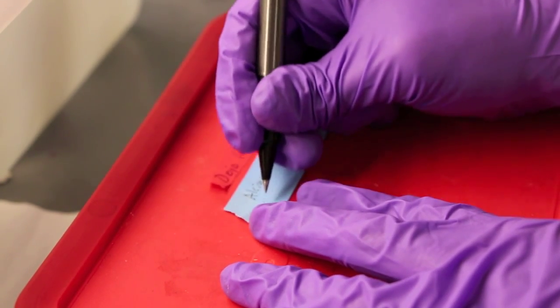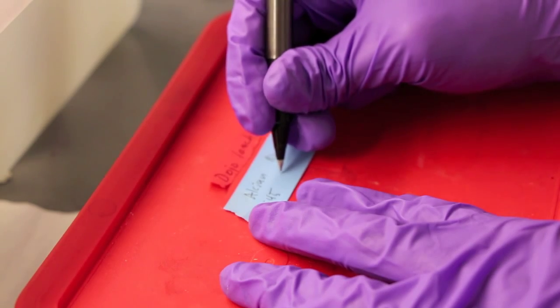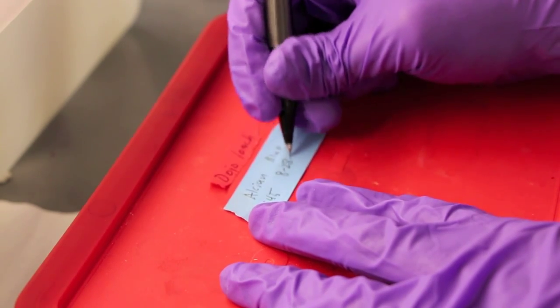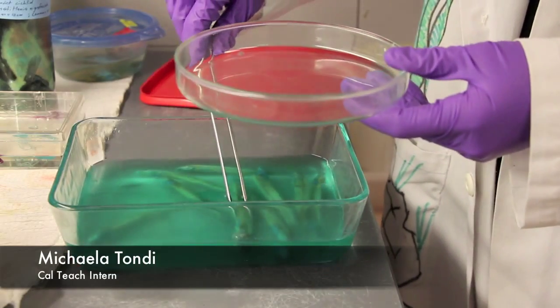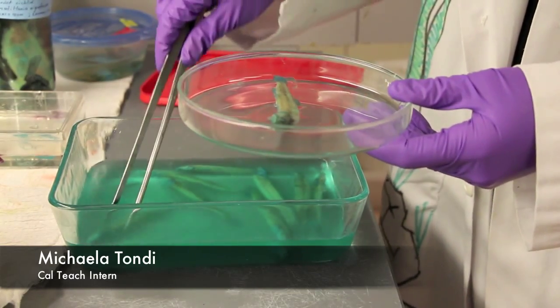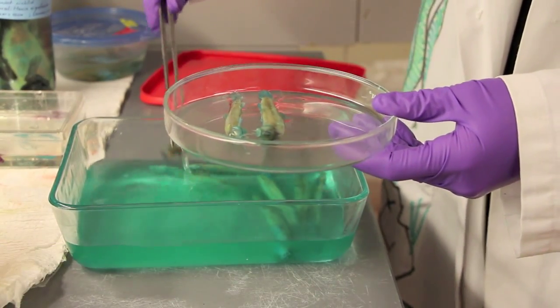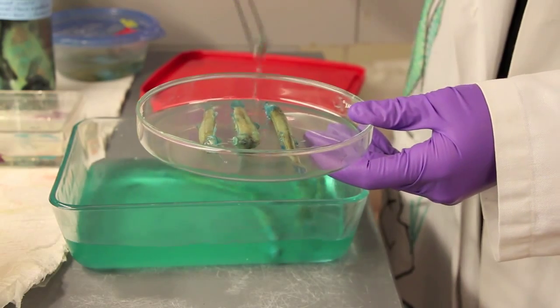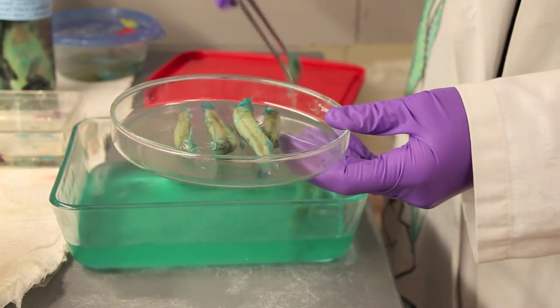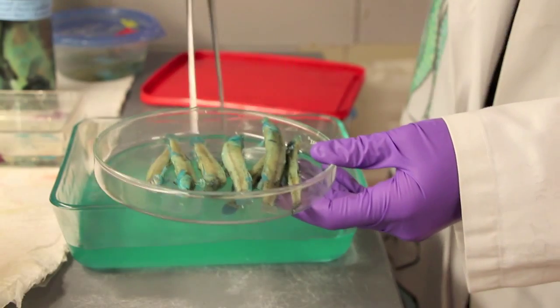Remember, you don't want to mix any of these chemicals up, and you want to be sure you know when to take it out to proceed to the next step. After waiting 3 to 24 hours, or after your specimens are properly stained, remove them from alcine blue. As you can see, the alcine blue stains the cartilage of the fish.